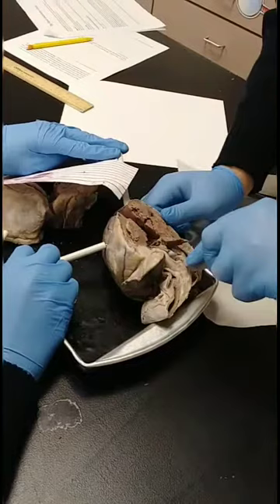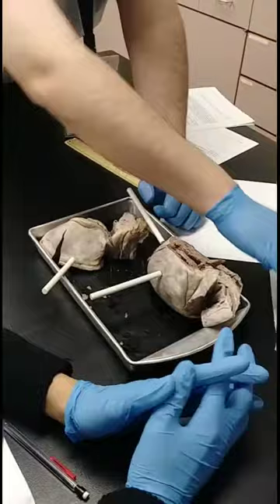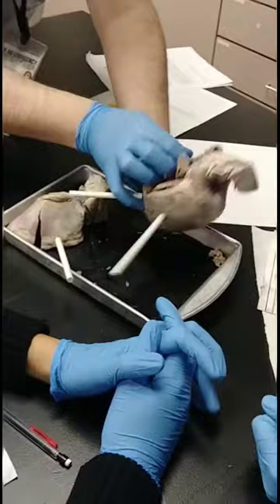Right there. Be careful, guys. I mean, we don't want to cut it all the way to the top, correct? You're already at the top. Okay, so then deeper. Yeah, it's all the top. So what you have here, that's all the left side of the heart. Okay? I'm sorry, this is the right side of the heart. So this wraps around like this. That's all the right ventricle.